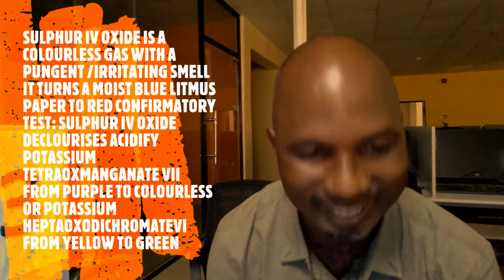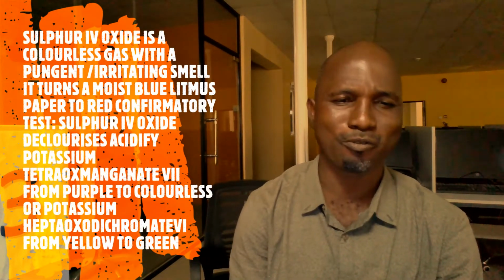The next one is sulfur 4 oxide. Yeah, sulfur 4 oxide is SO2. It's a colorless gas, but it has a pungent smell. Some people say it has an irritating smell. Pungent, irritating, choice of words. Now, it also turns a damp or moist blue litmus paper to red, showing that it is what? Acidic.